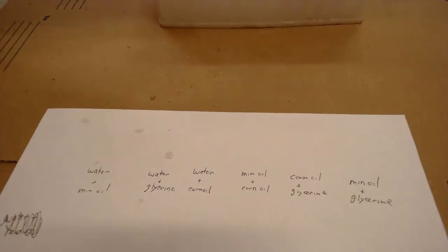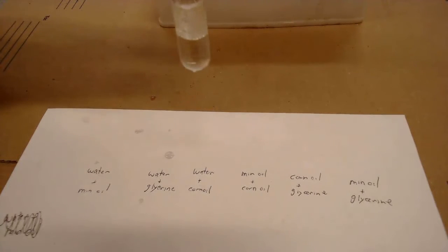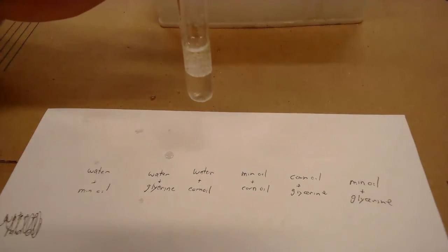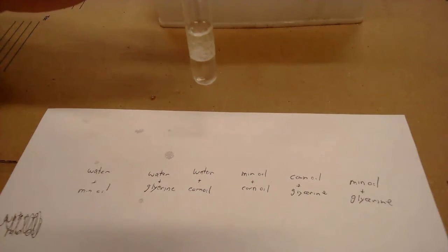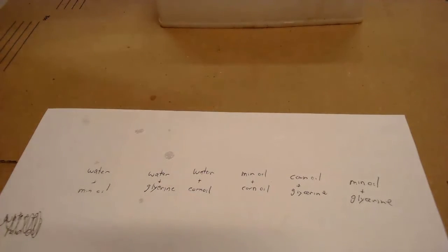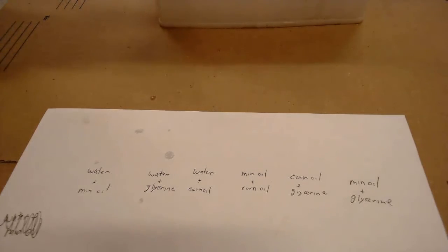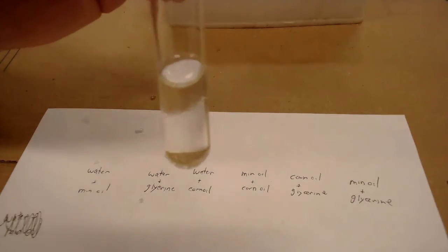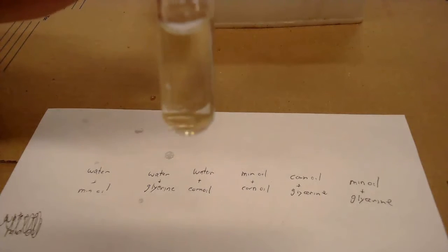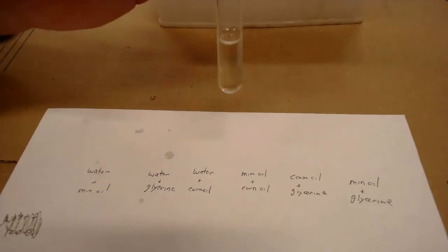The next one we have water and corn oil, and again, do you see that layer right in between them? They are not mixing. Our next one, mineral oil and corn oil — look at that, it all looks the same all the way through. There's no line. So the mineral oil and the corn oil mix.